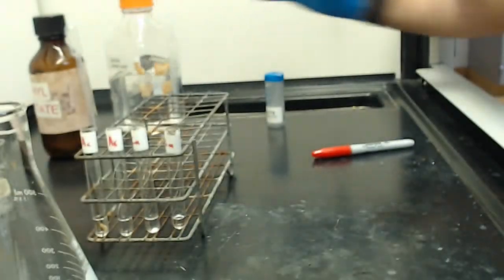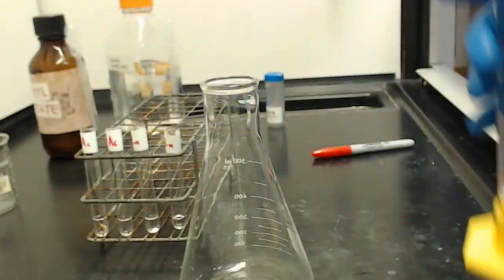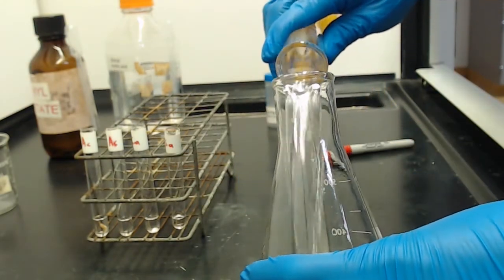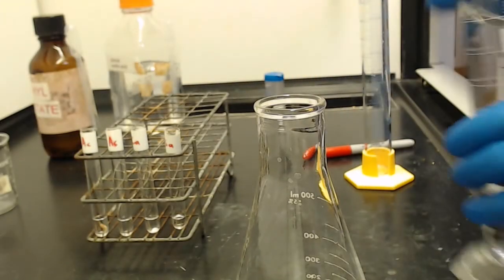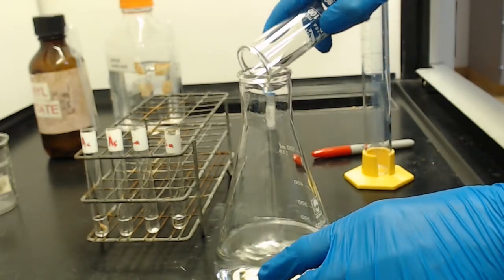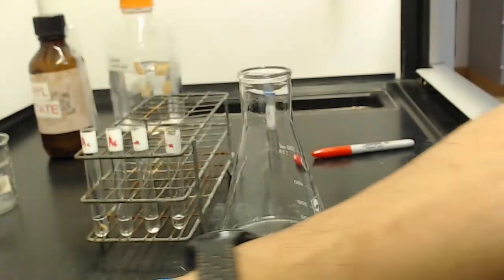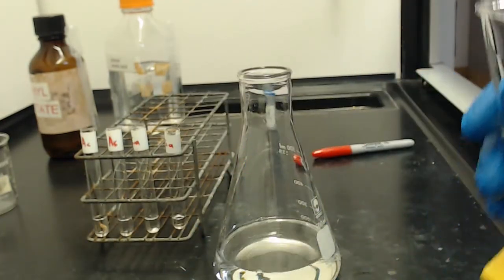I went ahead and pre-measured out the solvents here. So I have 100 mils of our ethyl acetate, and then I have 80 measured out as well. So 180 mils of ethyl acetate. Then I'm going to add the 20 mils of our glacial acetic acid. That'll give us our 10%.